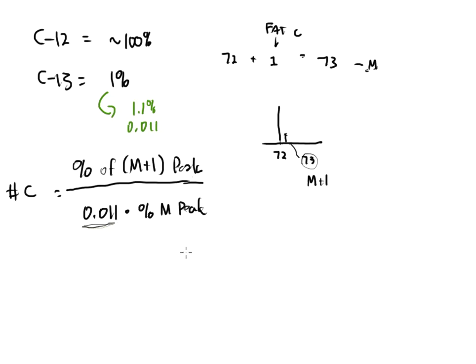So that's my calculation. The problem is that this only works with hydrocarbons. Hydrocarbons basically mean just carbon and hydrogen only. Oxygen cannot be in existence. Nitrogen cannot be there. Sulfur cannot be there. Any of those normal atoms that are involved in an organic molecule cannot be present here. It has to be hydrocarbon only for this thing to work, and that is it.